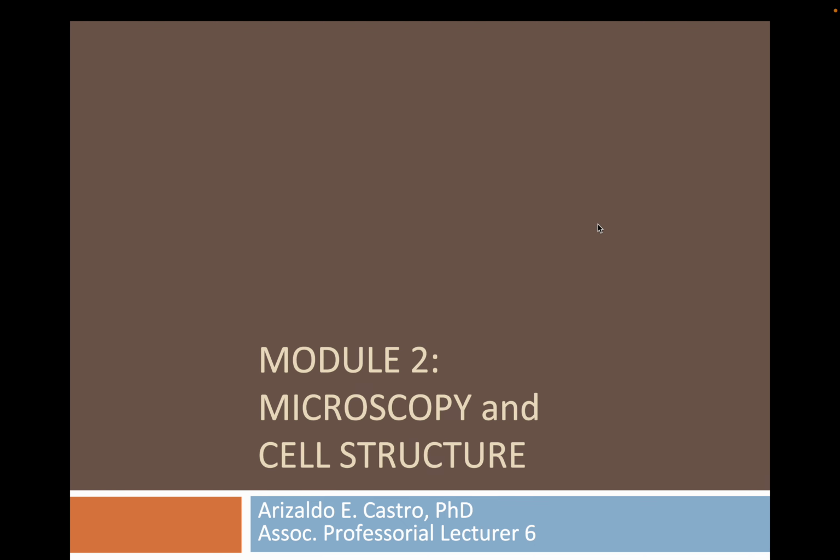This recorded session is dedicated to our second module for Zoology Laboratory. We'll talk about introductory concepts on microscopy and cell structure. So these are activities 1 and 2 in the handout that I have provided, or in the laboratory manual for our subject.